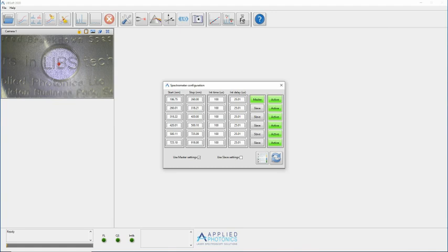There are at least 3 different types of Avantes spectrometers that can be used in the APL spectrometer modules. Each type has slightly different performance features and limits on the parameters that can be set, so it is important that the correct one is selected in the system configuration window when the libsoft application is started. Once initialized correctly, the integration time and delay values will be automatically coerced to the allowable range for the spectrometer type in use.